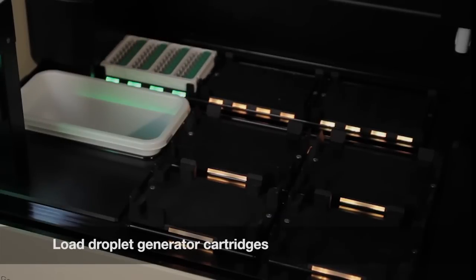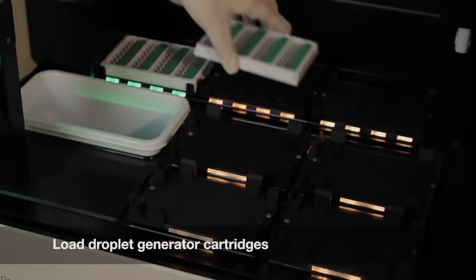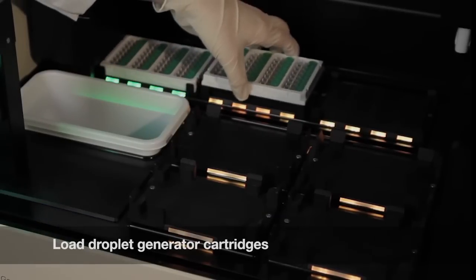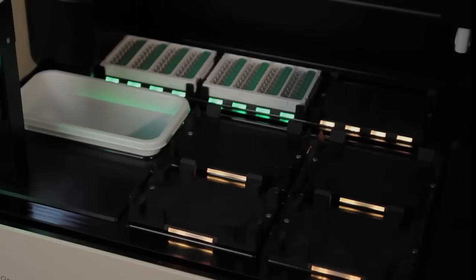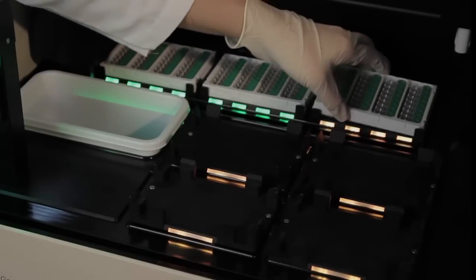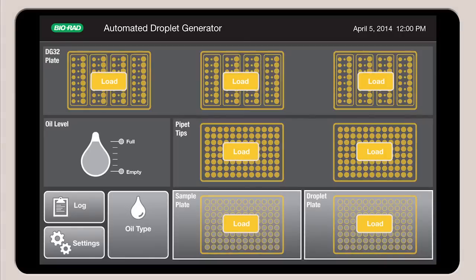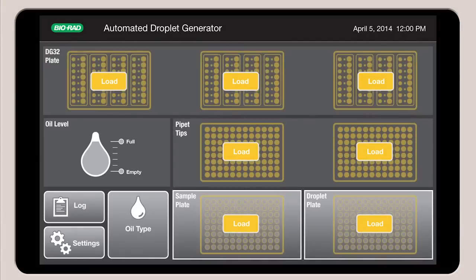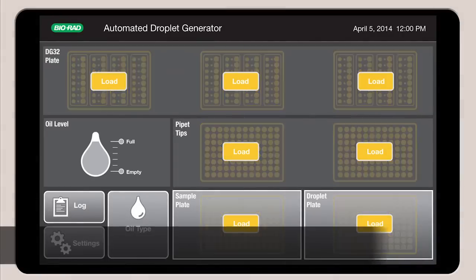As DG32 cartridges are loaded, the lights on the deck turn green to indicate correct placement. The corresponding icons on the screen will also turn green.